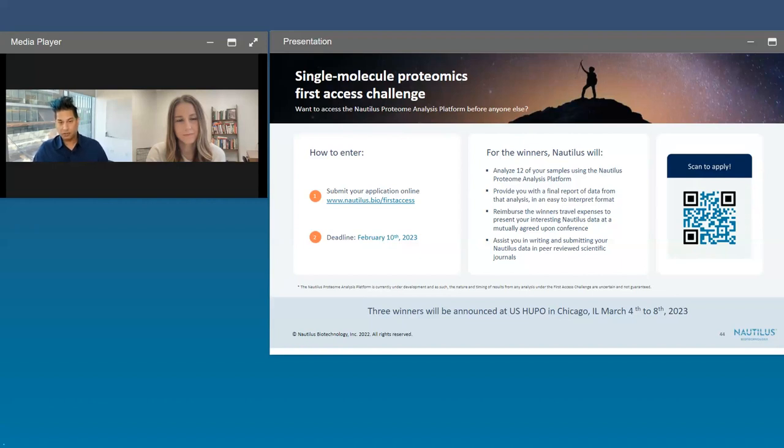So we actually calculate multiple false discovery rates to account for variation in protein database, variation in binding events, variation in false positive binding rates, et cetera, to build our confidence in any given identification and to provide references for false identification rates. And then that directly translates to quantitation because as your false identification rate is loosened, there will be some impact on your quantitation because your counts are going to change subtly.